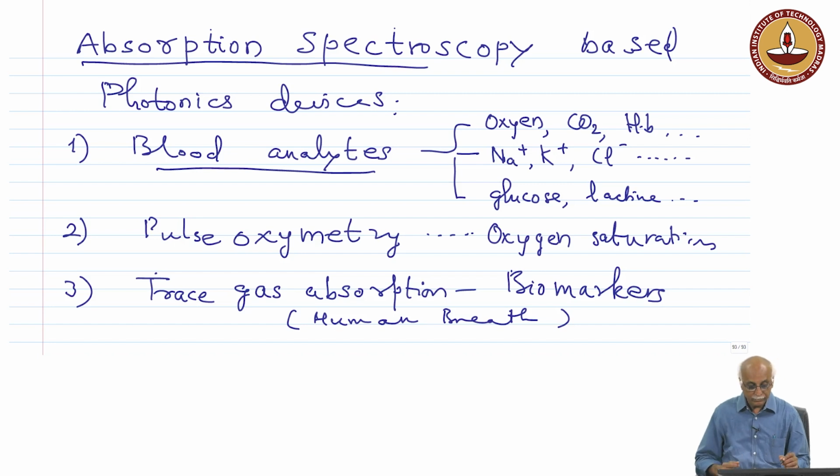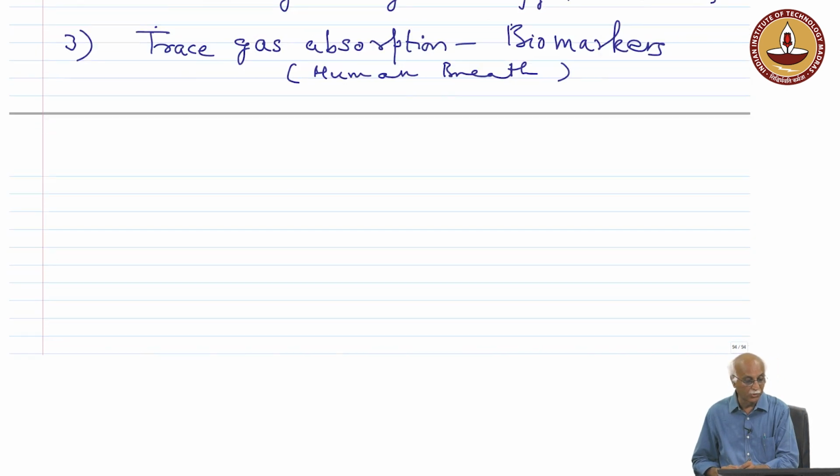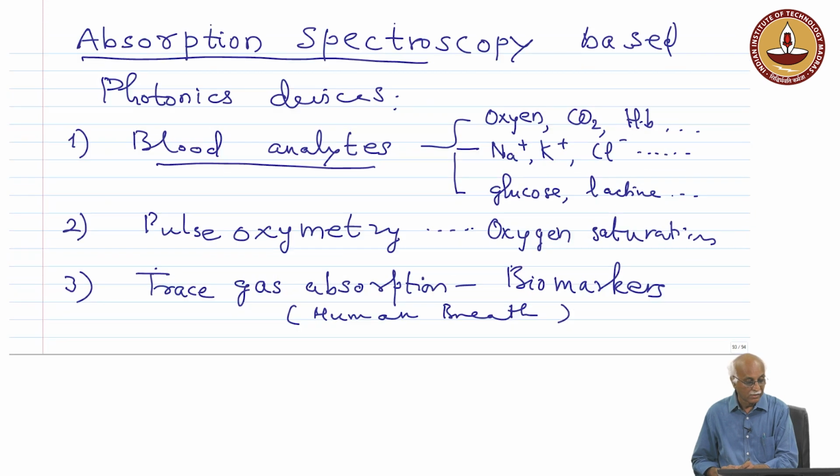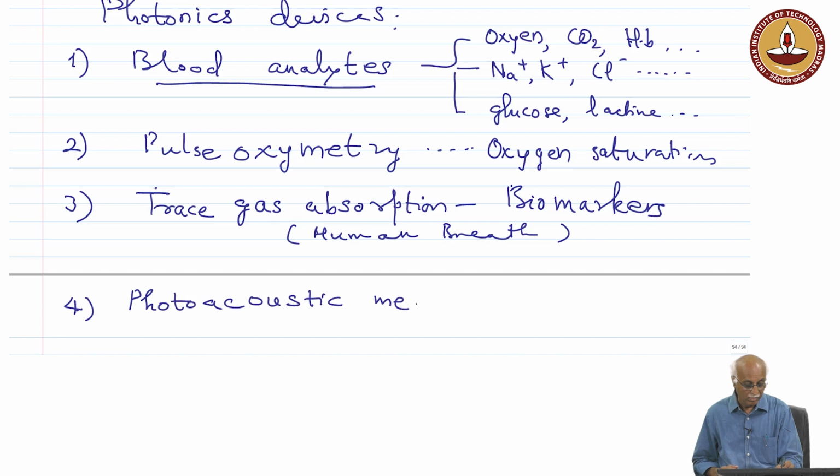There is one more application of this absorption spectroscopy technique, an indirect application, which is on photoacoustic measurements.